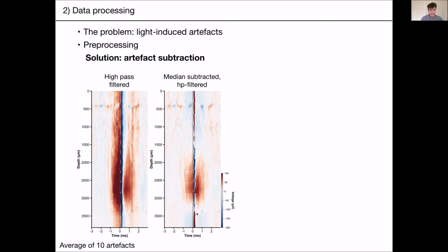In this very particular case, it did not. Because the artifact wasn't timed exactly similarly at the top or the bottom, you still have very strong negative deflection or positive deflection depending on where you are on the probe. And it did not get rid of the ringing artifacts, which are stronger here than up there.